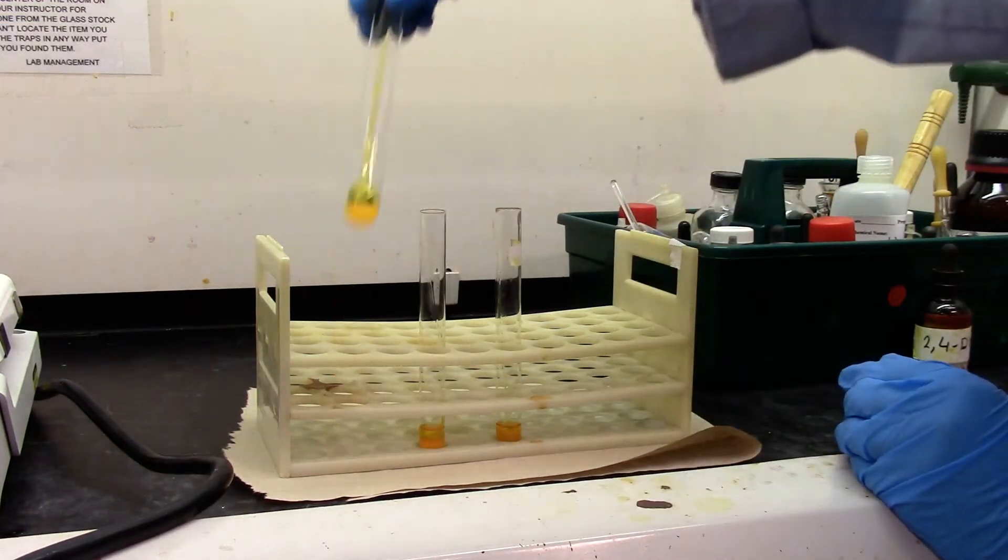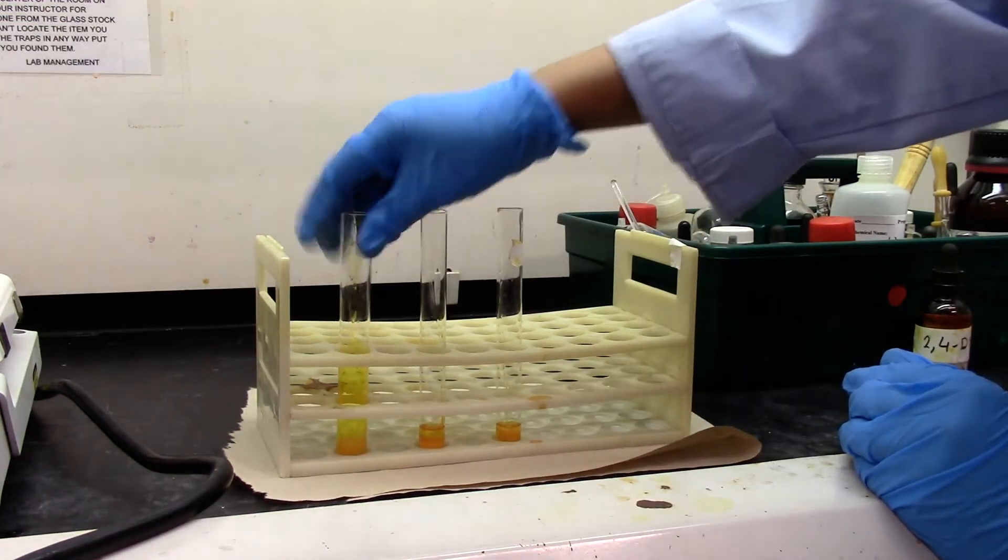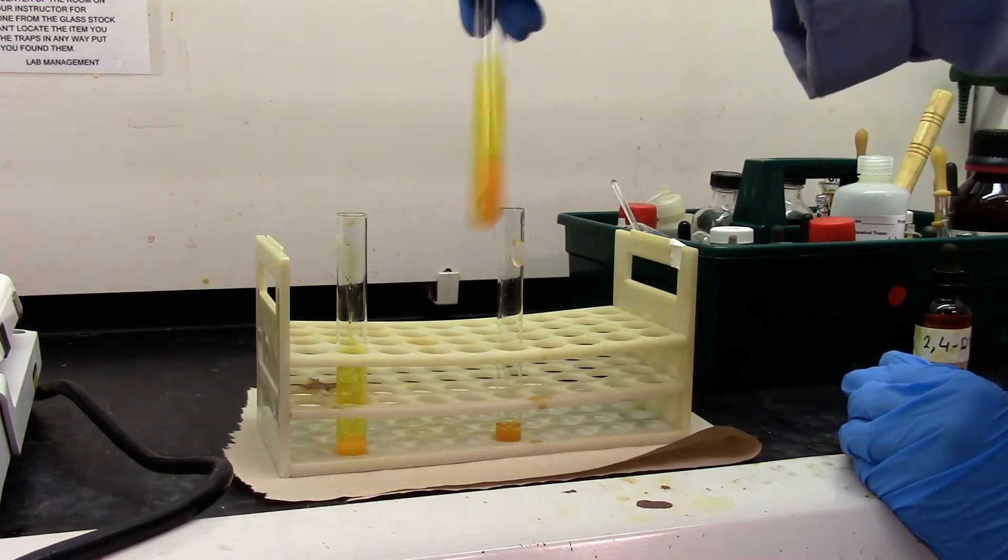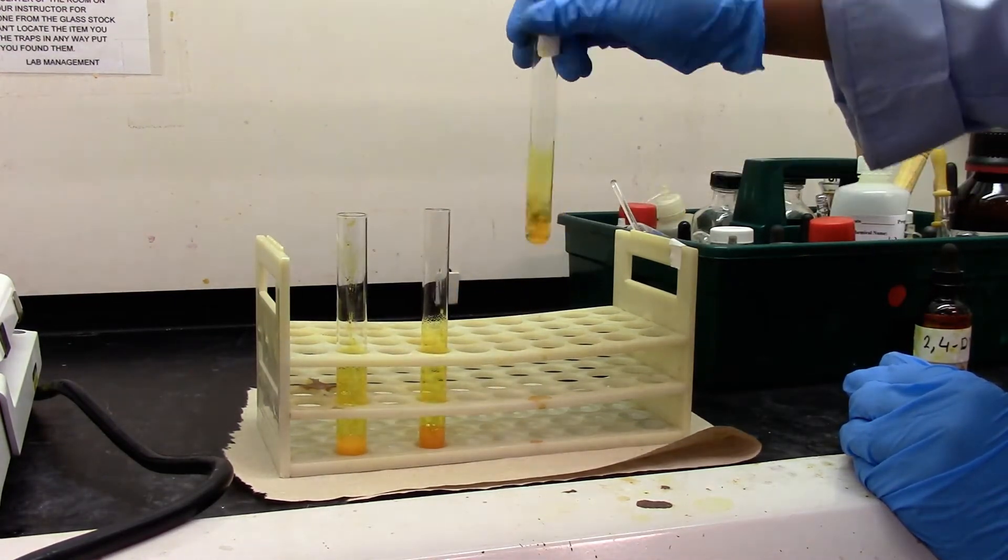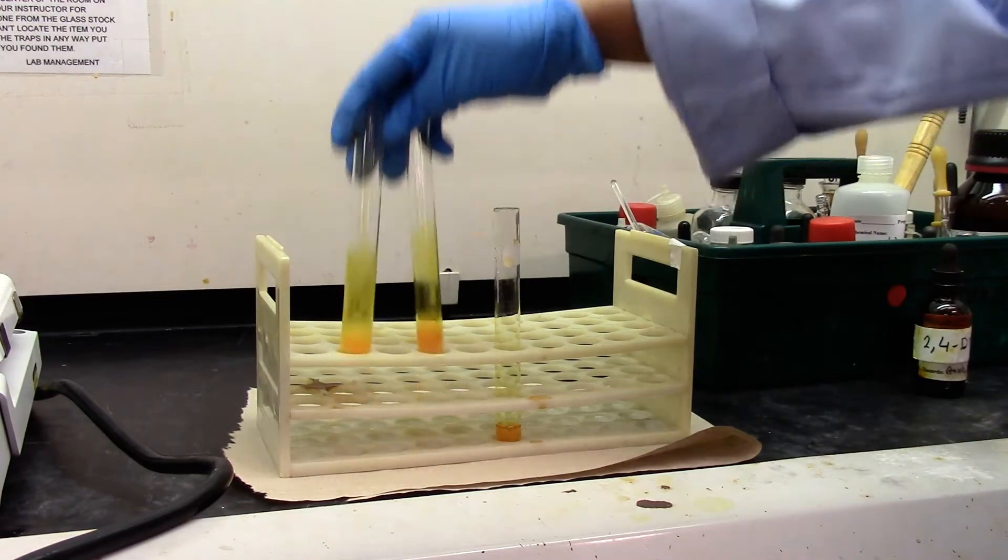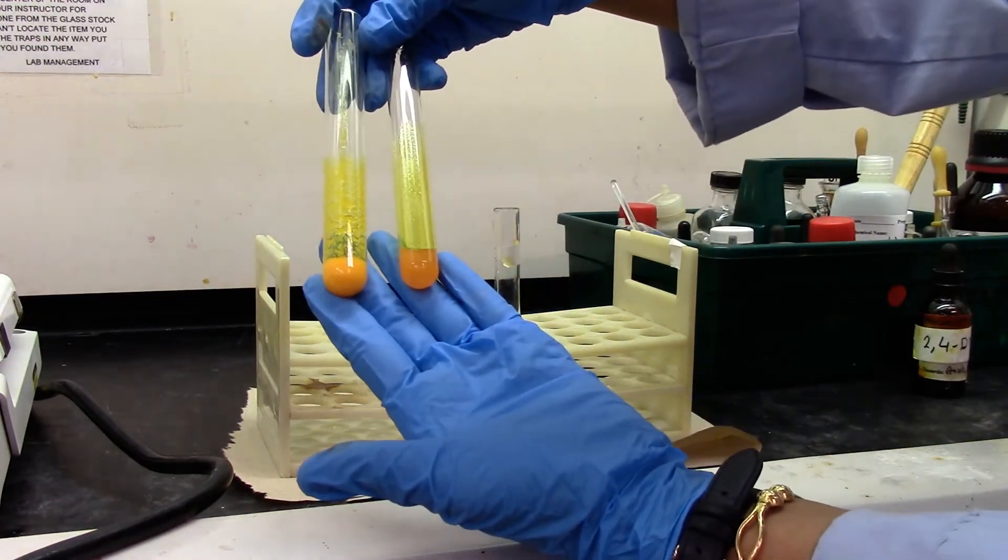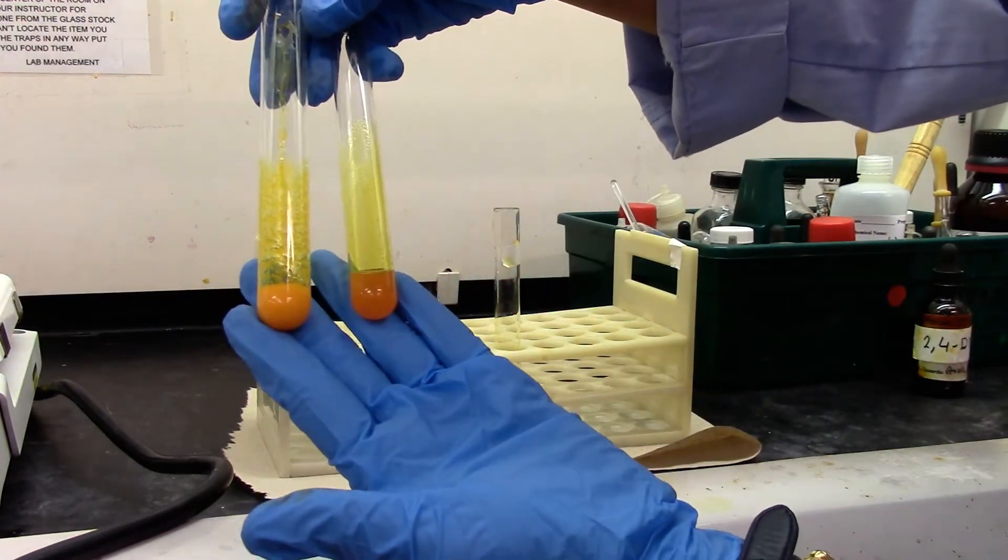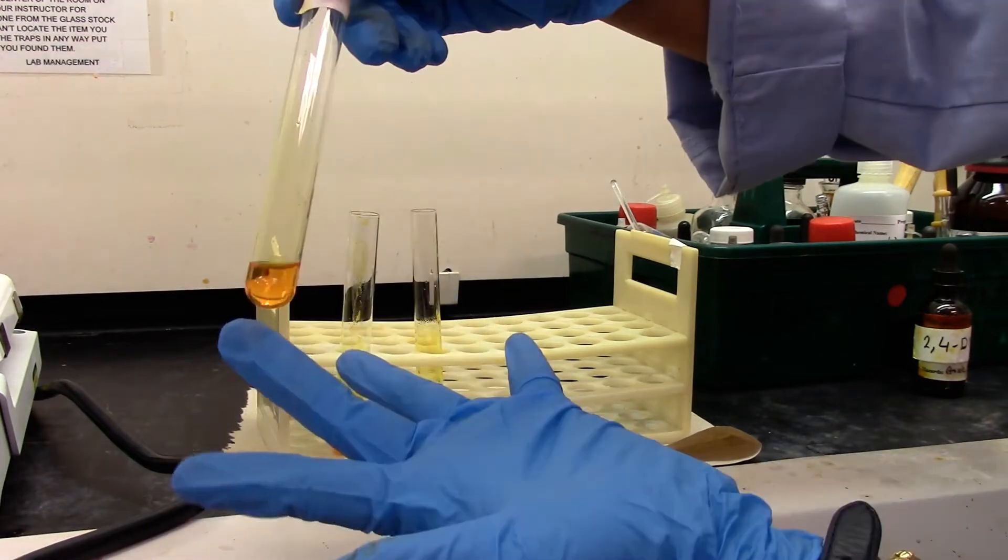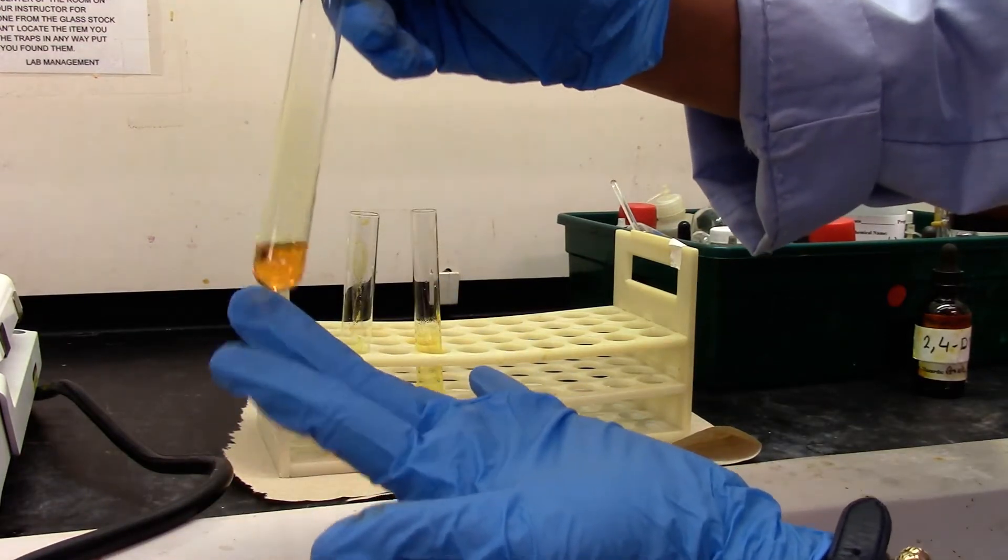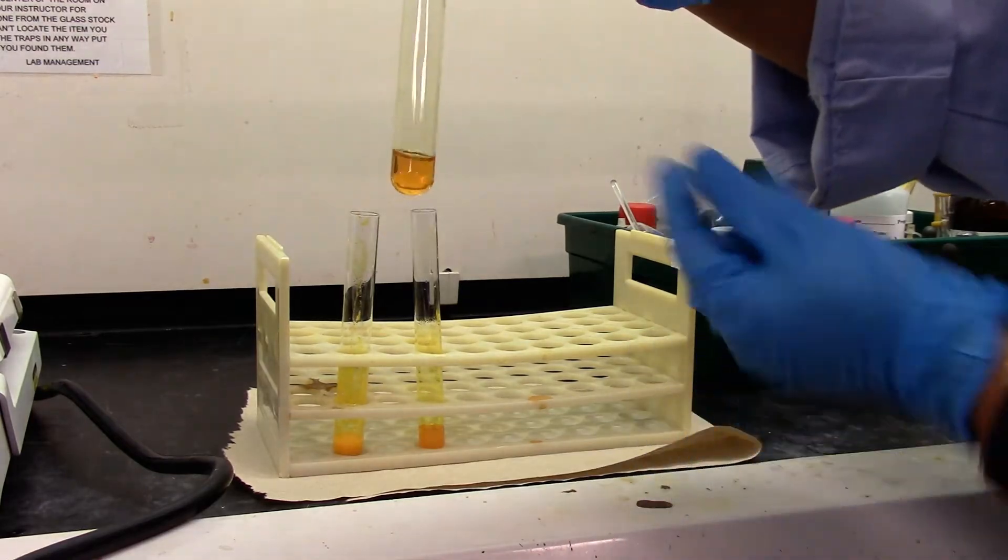My aldehyde and ketone both produce yellow precipitate. Negative test with an alcohol is just a yellow coloration, no precipitate.